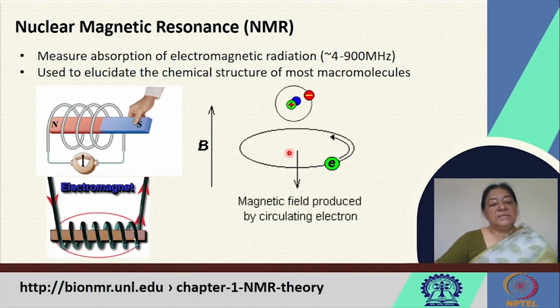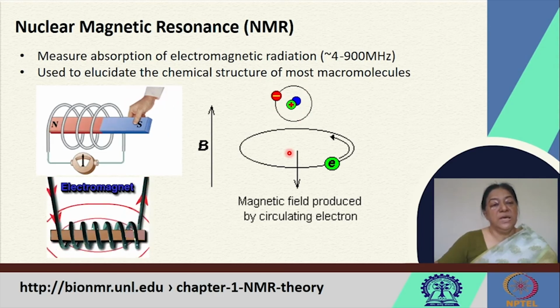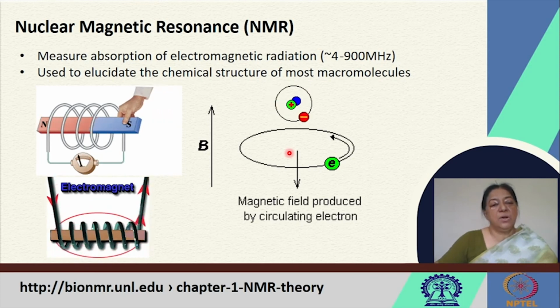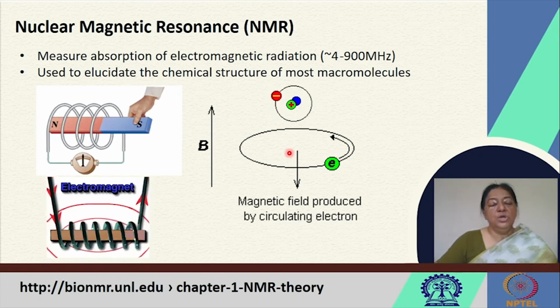If we now look at a different methodology where we can also understand the chemical structure of many macromolecules, nuclear magnetic resonance. In our overview of the protein structure prediction, we had briefly looked at NMR in the understanding of a protein structure and how it may be predicted. When we look at NMR in this context, we are looking at a characterization of the protein to know whether the protein is in its folded form, to know whether the protein will be able to perform its function.